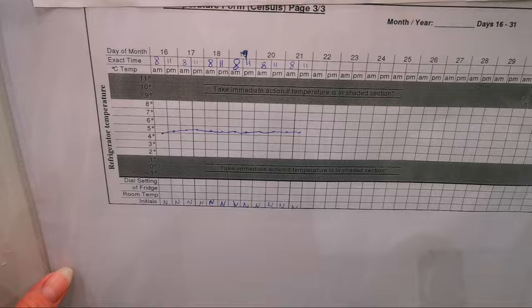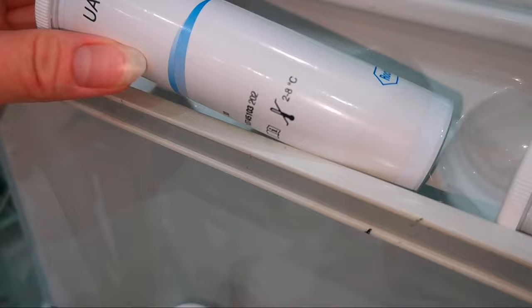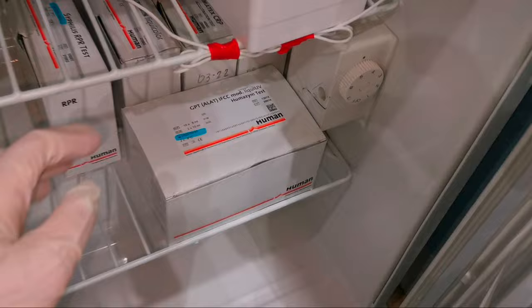This is the temperature monitoring sheet. Now let's see what's in the ref. This is the uric acid strip and the other one for control.